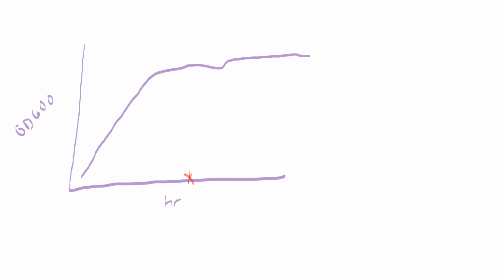Well, all you do is go straight line up here to where it meets the line. This is not a straight line because I can't draw. Now come over here, and what number do you have here? On the graph it's actually written right here. So you're going to have a number. How are you going to figure out the absorbance? This is the same thing that you did previously.